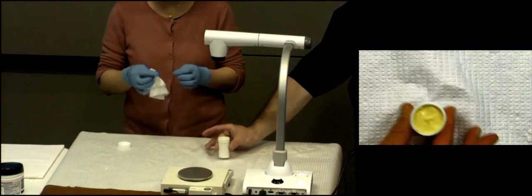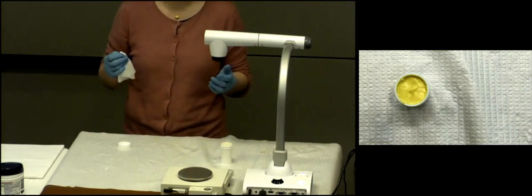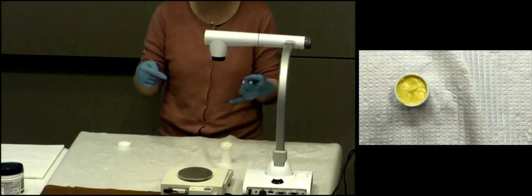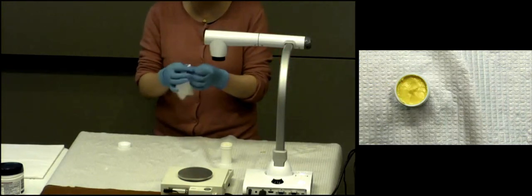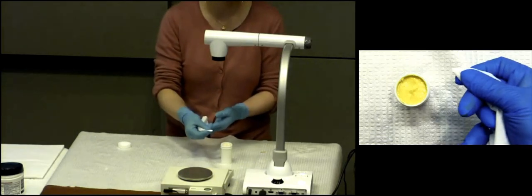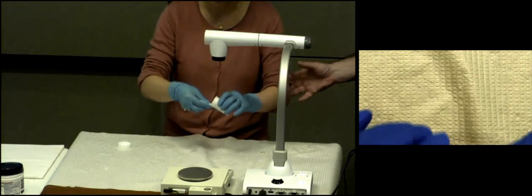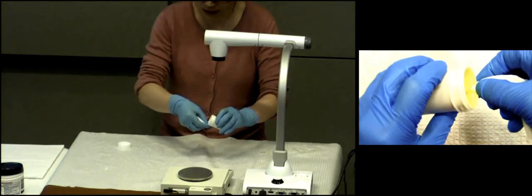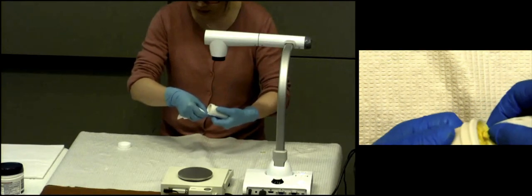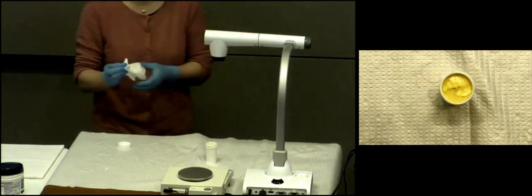All right, I'm not quite confident that this is good looking enough yet. Because did you ever see something on the edge inside the bottle? So you want to use a piece of ointment paper, a piece of tissue, fold it in the corner like this. All right? And let's clean the inside of your bottle. Okay, I think that looks a lot better.